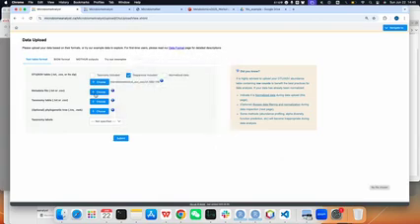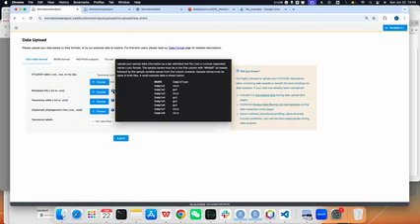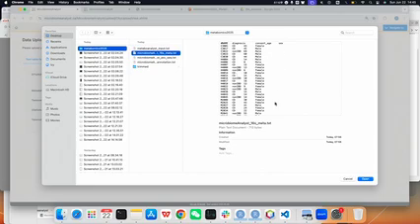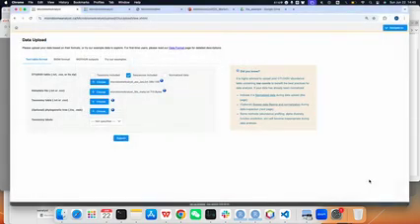And then the second important information is the metadata. You can see here the metadata. The first is also the name column. It's the sample name, which should exactly match your ASV abundance table. Then you can have several columns, like the group, the age, and whatever meta information you would like to include to treat as covariates later. Here we just submit what we got from the raw data processing. It looks like this, same as the example.